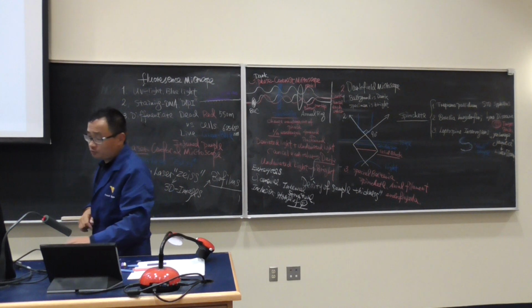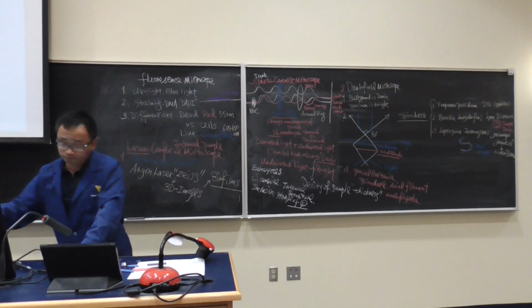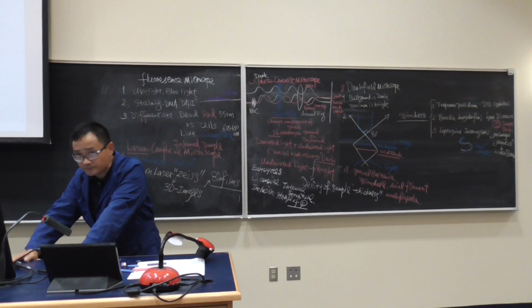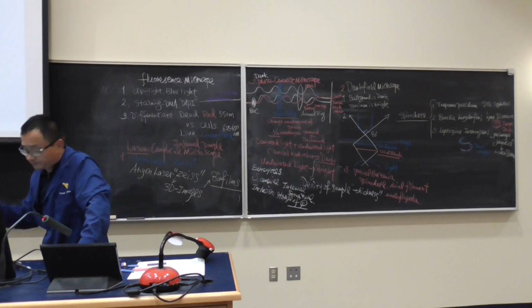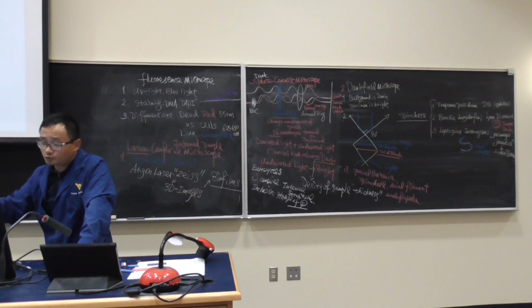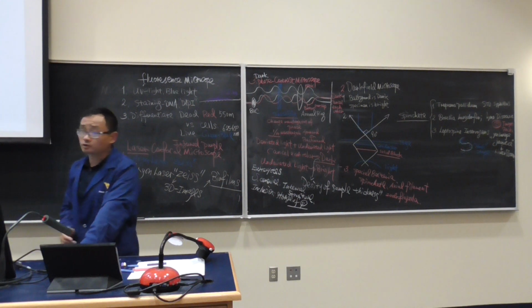And the second thing I did is I treated them with distilled water. So not many cells died. Some green cells are still dominant, and red cells show up. The color spectrometer shows it extended a little bit, which means a mix of the green and the red color. Then I tried using chlorine solution.